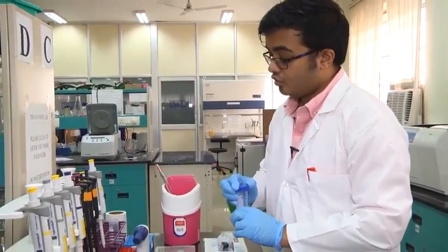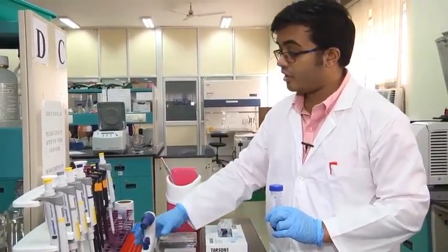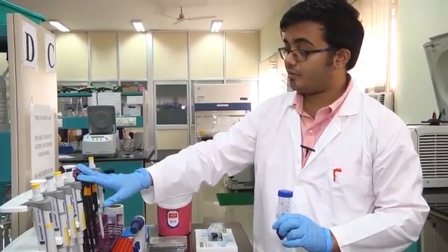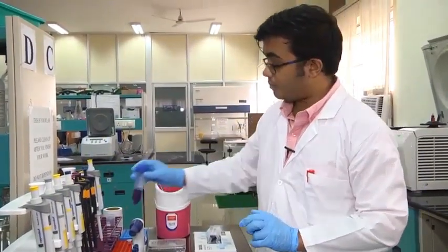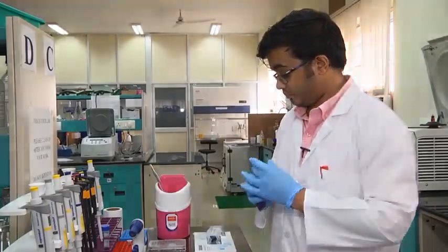In this case, you don't have to worry about releasing the pipette, because this does not work on that mechanism. But in these cases, even for multi-channel pipettes and single-channel pipettes, you always need to keep the pipette in the released condition when not in use.